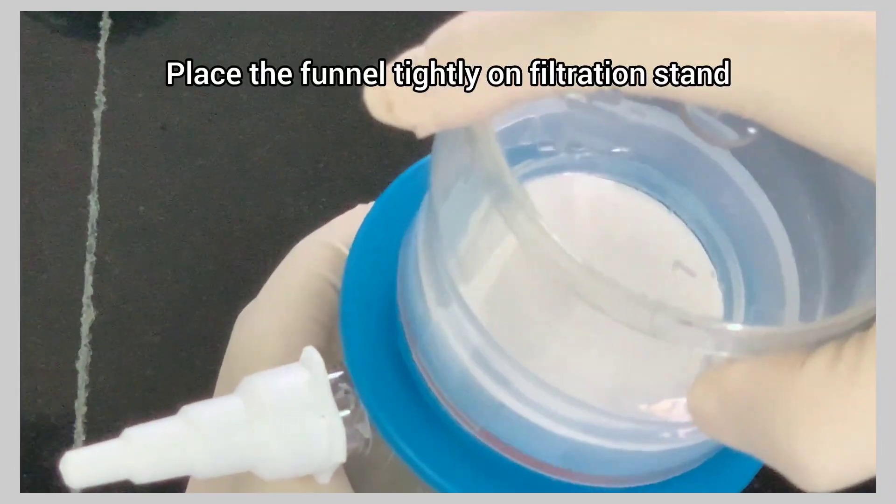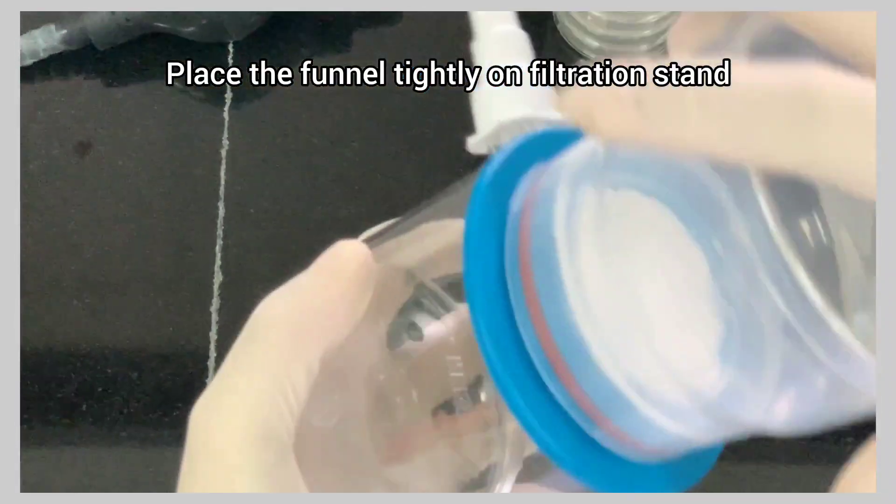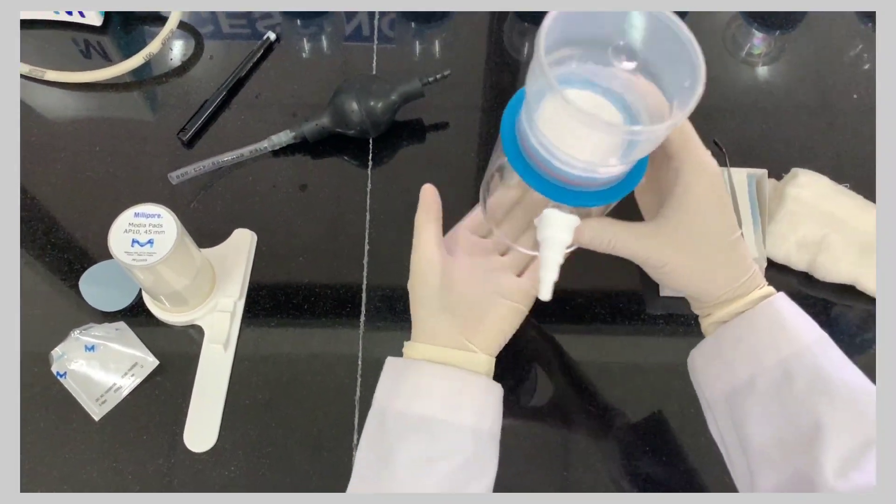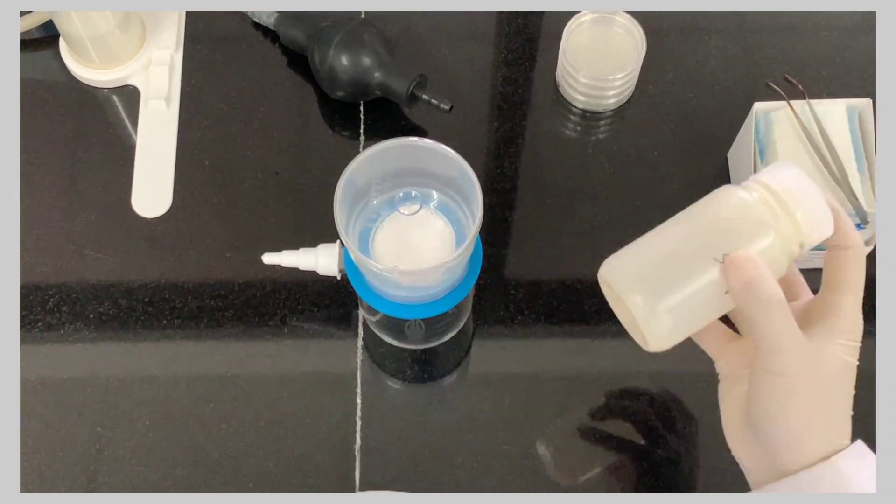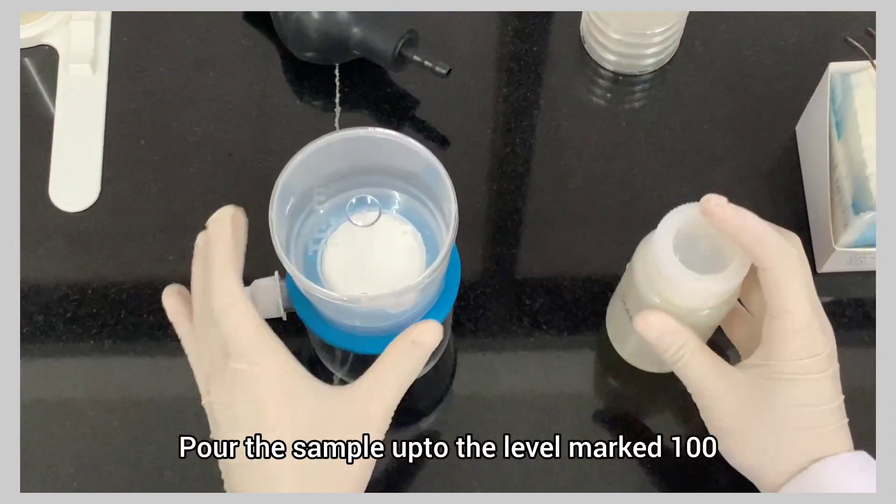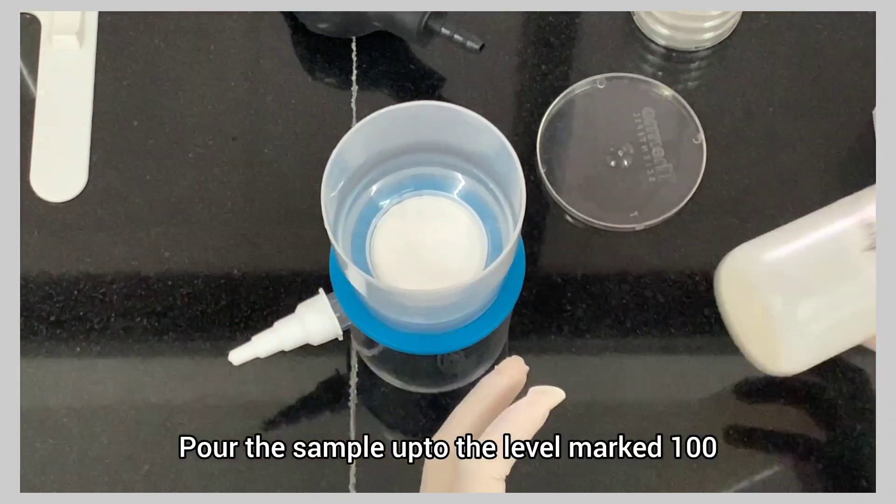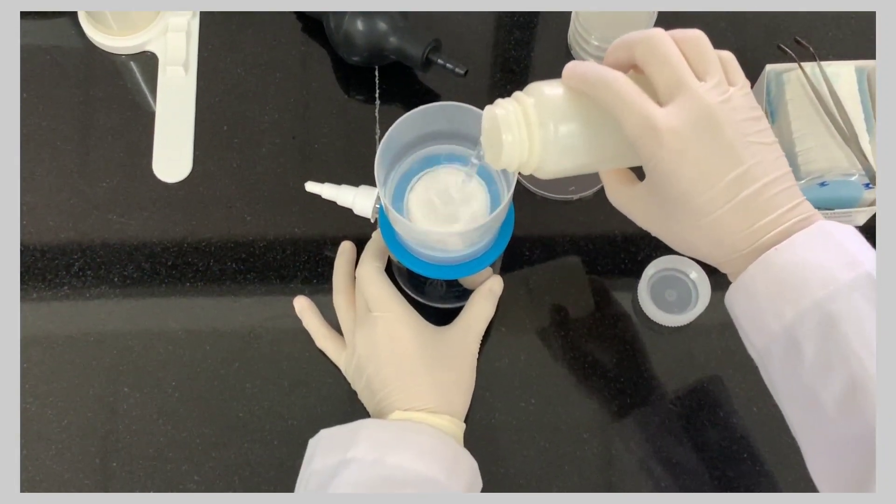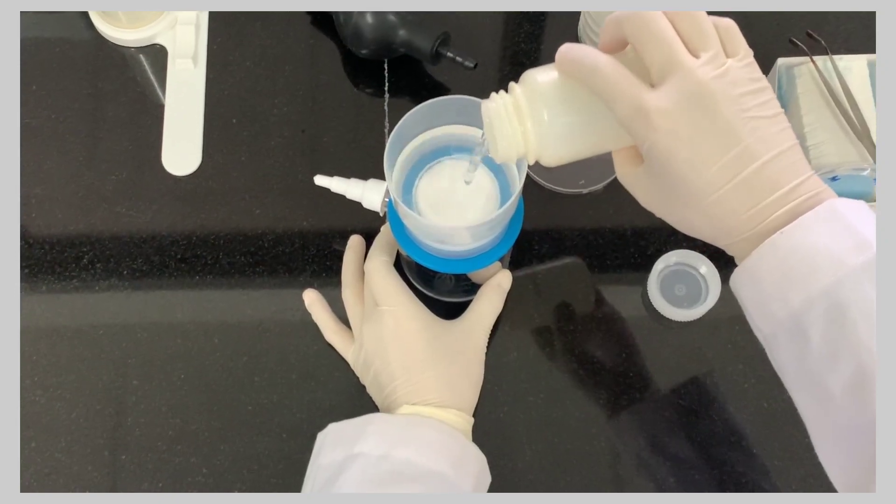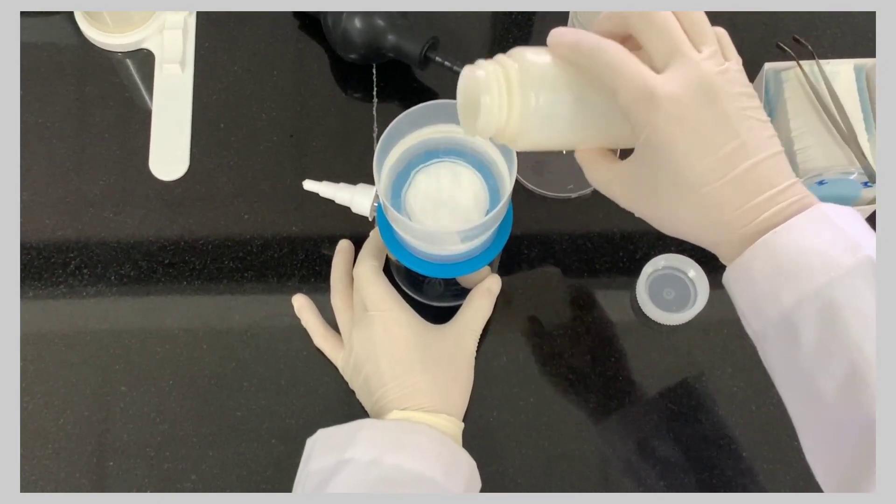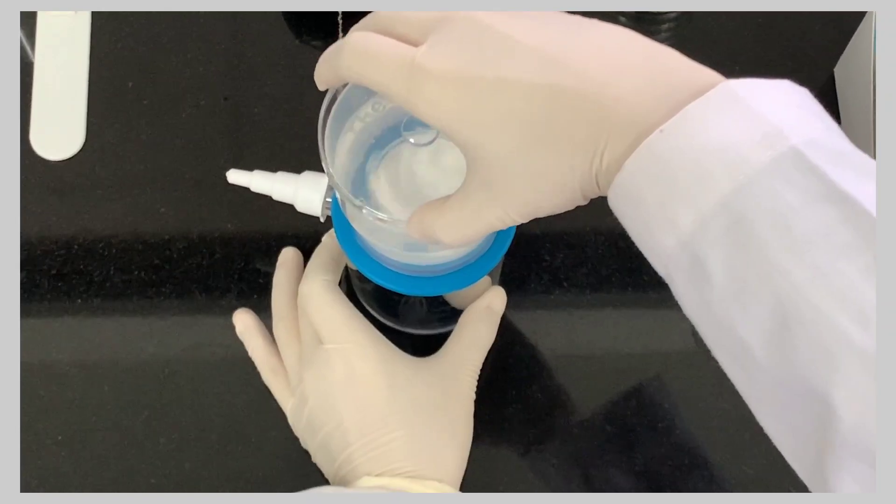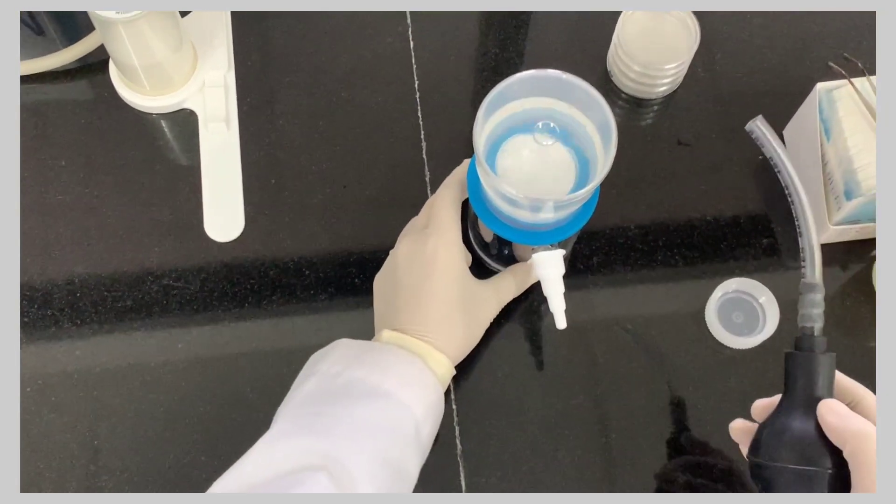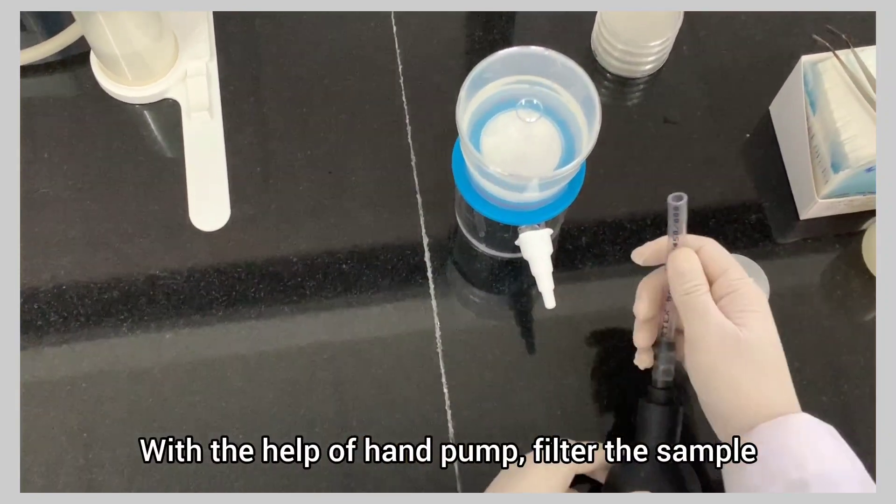Place the funnel tightly on filtration stand. Pour the sample up to the level marked 100. With the help of hand pump, filter the sample.